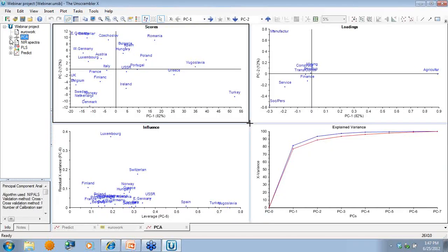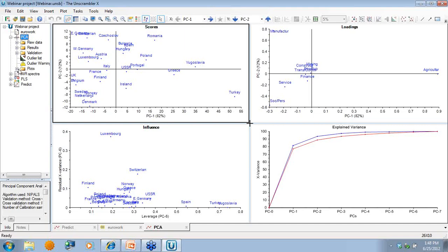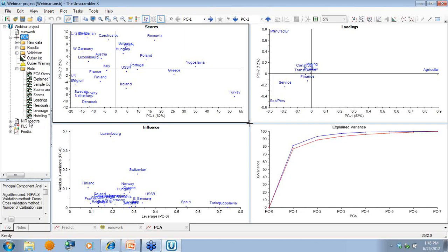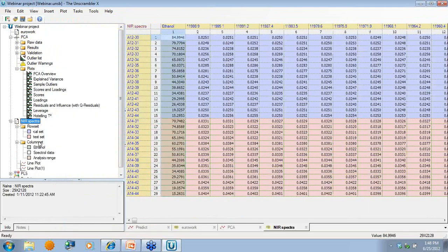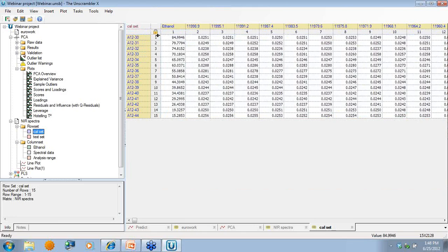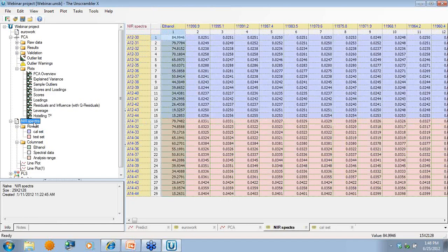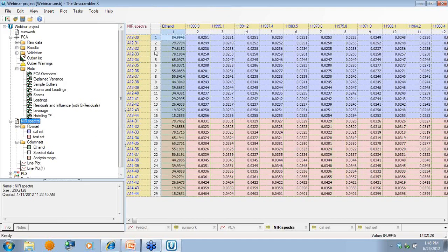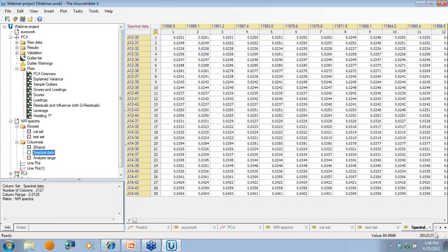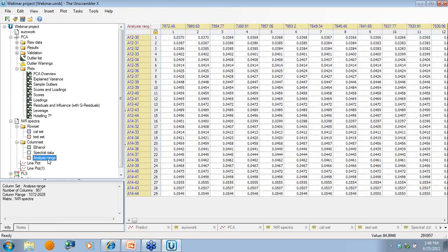Expanding the PCA node shows information on raw data, results, validation, and all associated plots. Another matrix in the project contains near-infrared spectra organized with row sets of a calibration set of 15 samples and a test set. Column sets include the response variable of ethanol, the entire spectral range of 2,127 variables, and a subset for the analysis range.